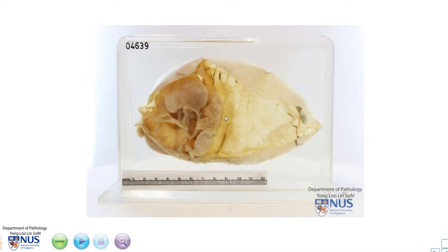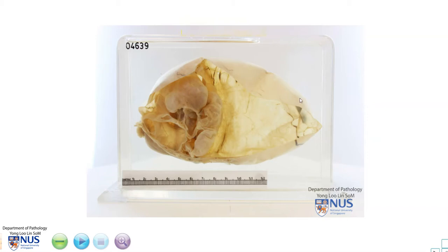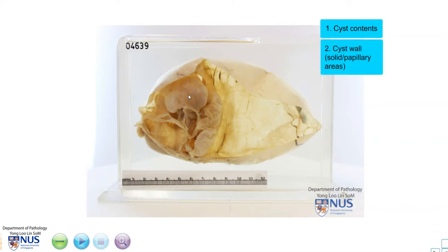Moving back to the cut surface, this is a multilocular cystic ovary. Multilocular means it's got multiple cyst compartments or locules, and when we are dealing with a cystic lesion, we need to look at the contents of the cyst as well as the cyst wall to see whether there are any solid areas or papillary areas.